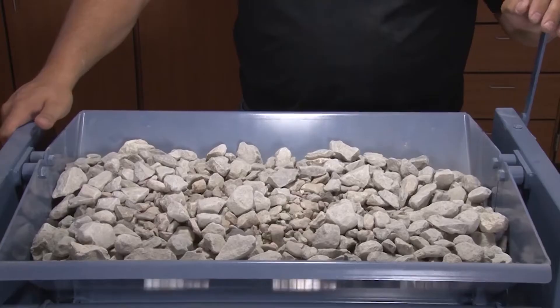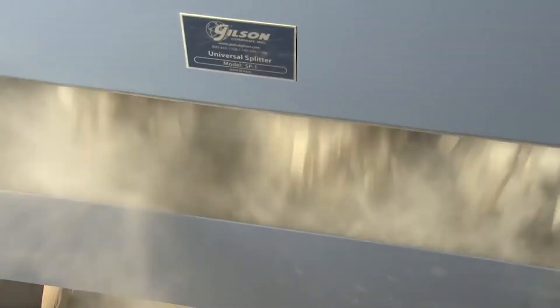Samples up to one cubic foot are accurately and quickly divided with a minimum of handling.